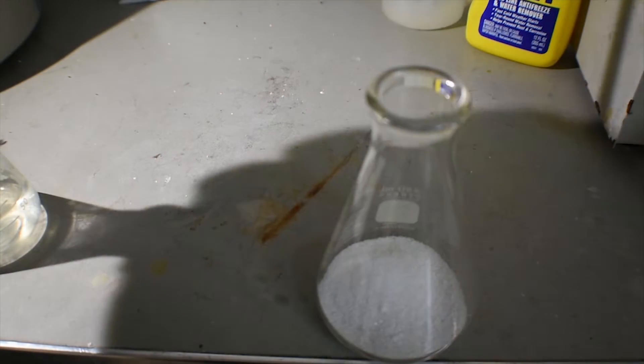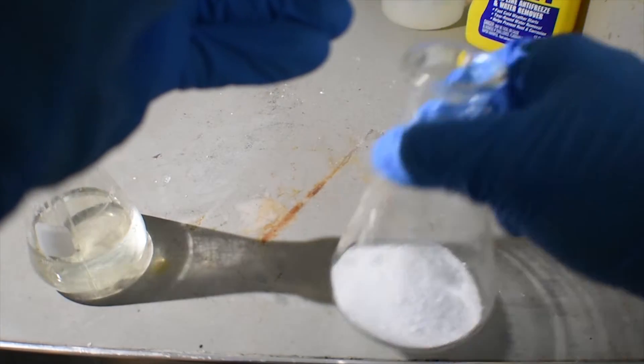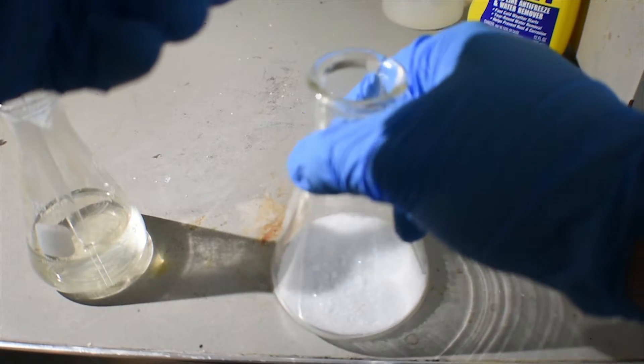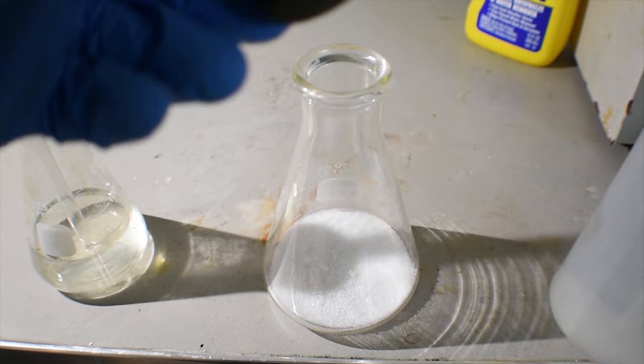Now I'm going to put the pipette in the trimethylborate and just mix these two powders around. This will probably generate a small amount of ammonia at first, but not really until we add some water — and I'm going to do that through this wash bottle here.